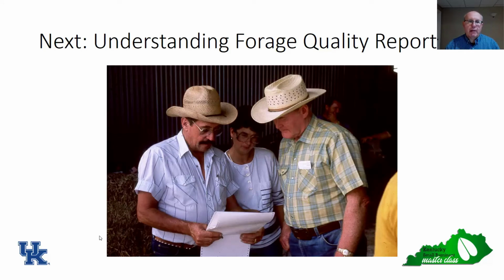So next I want to talk about understanding forage quality reports. And I learned a lot about this from operating a mobile NIR testing laboratory at the University of Missouri. When I finished analyzing the sample and handing the results back to producers like you see here, I thought my job was done. In fact, my job was just starting. It was almost universal that their response was to look at the sheet and then hand it back to me and say, well, is it any good?